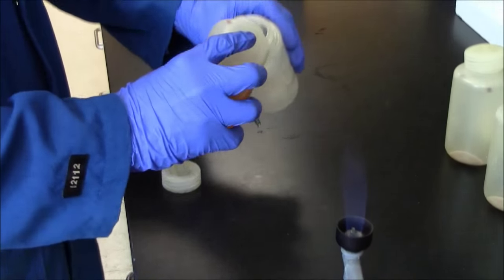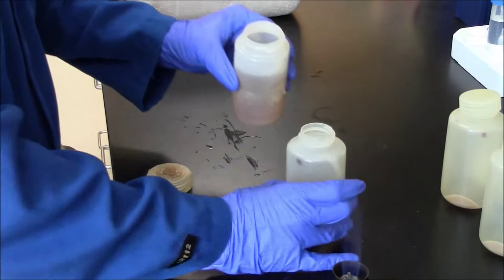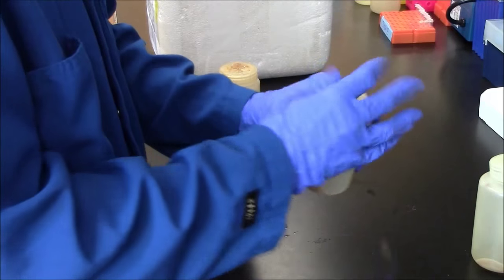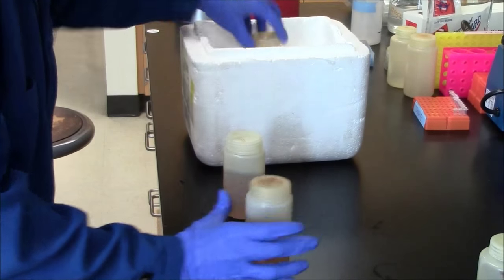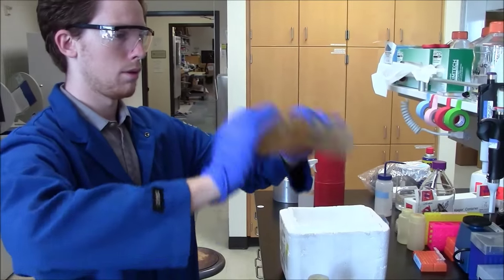In the second bottle, the one we're transferring to, the phage will start to precipitate with the PEG and the NaCl. That precipitation is aided by chilling, so these will go onto ice for 1 hour. Make sure the bottle is closed and tight. Here Josh is going to mix the contents by inverting 10 times. You can see he's counting them.